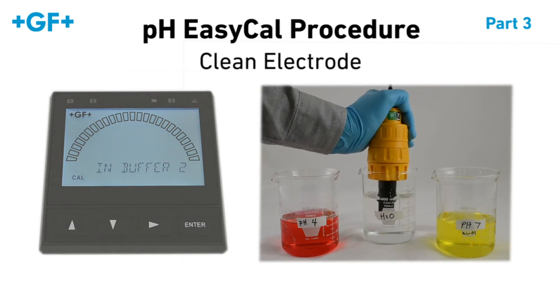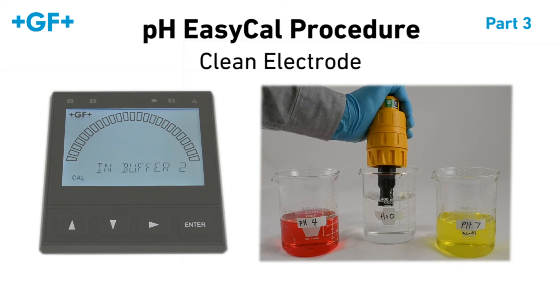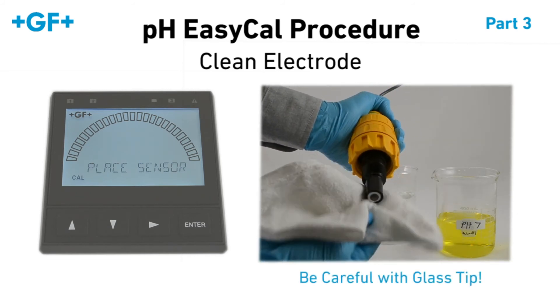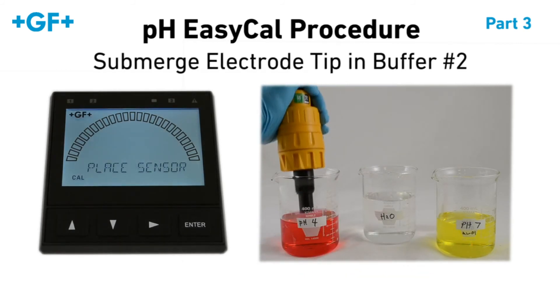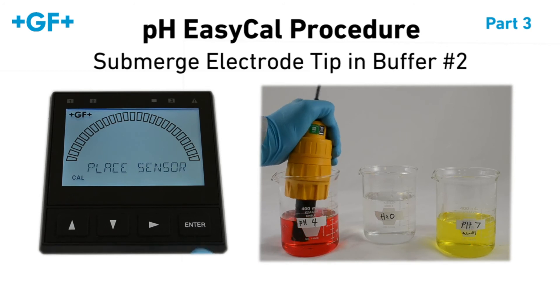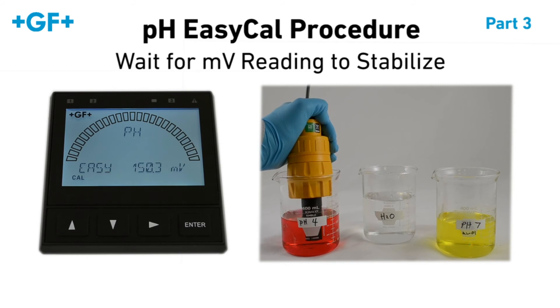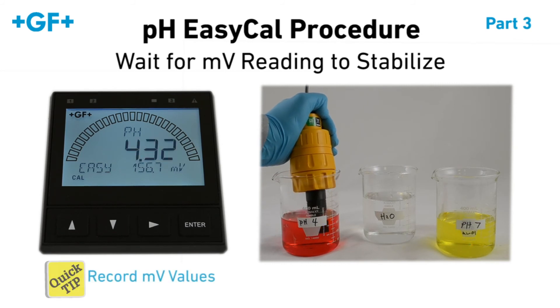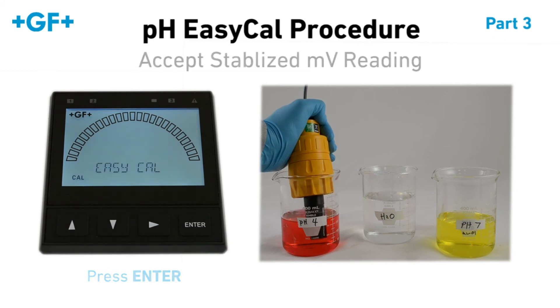We have to clean the electrode again before moving on to the next buffer. Place sensor in buffer 2 will flash on the 9900 display. Again, while holding the 2751 sensor electronics, submerge the electrode in the second pH buffer and press Enter. Same as the first time, we'll have to wait approximately 30 seconds for the millivolt values to stabilize. Make sure to record millivolt values. Once the millivolt value has stabilized, press Enter to accept it.